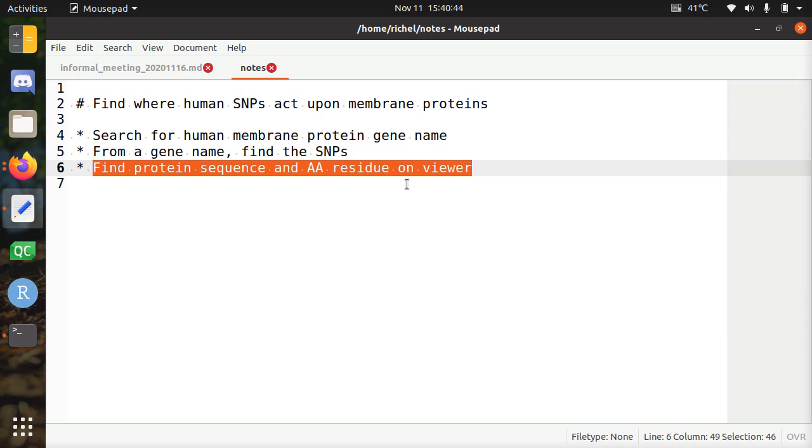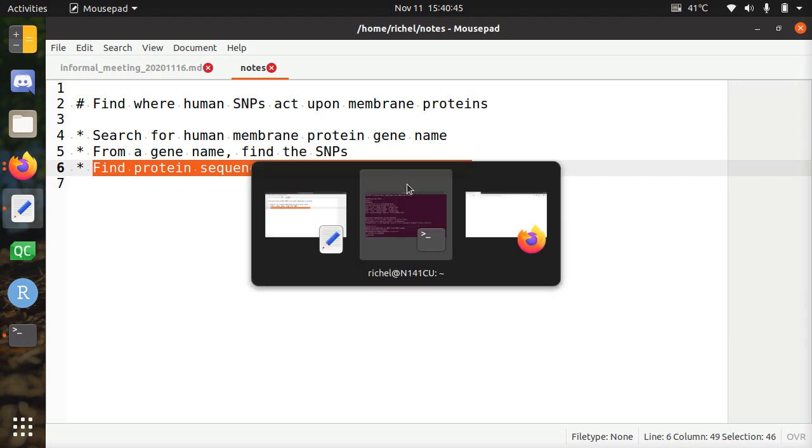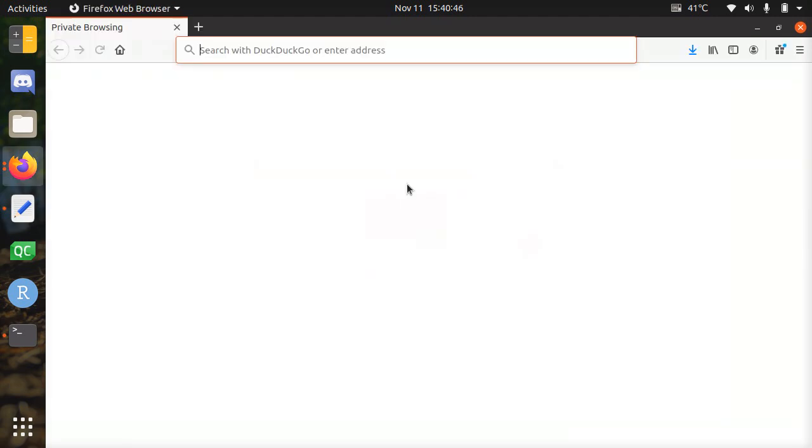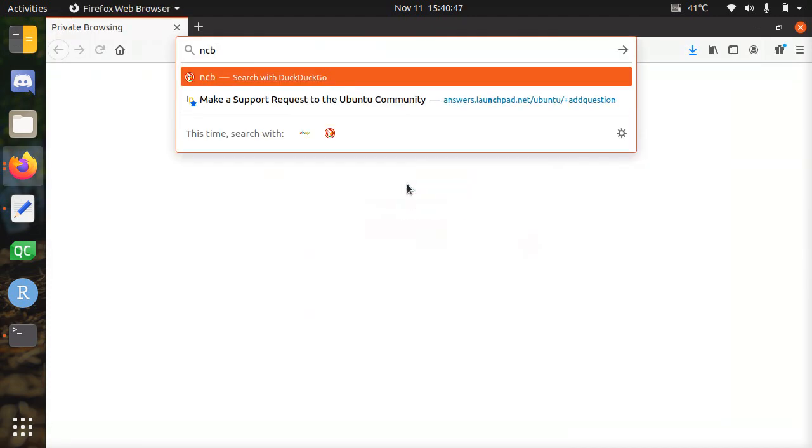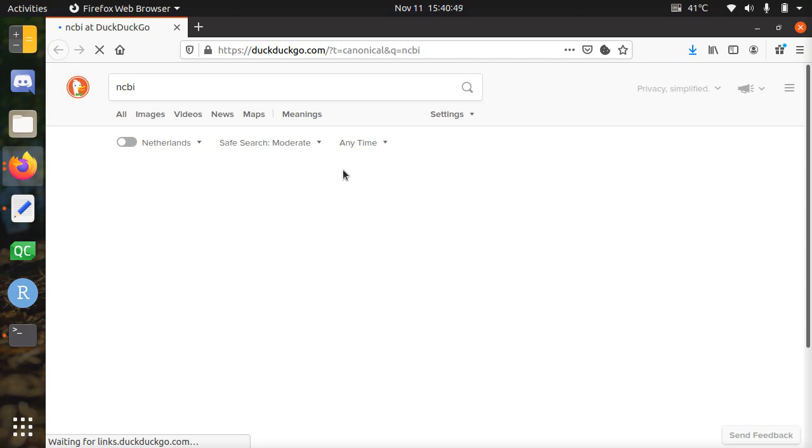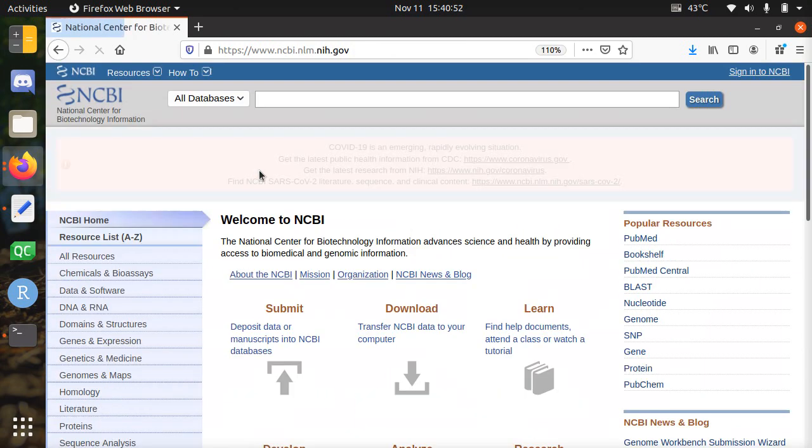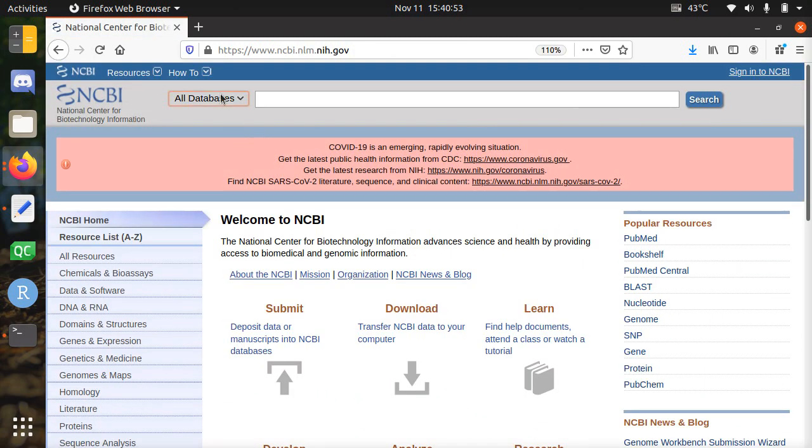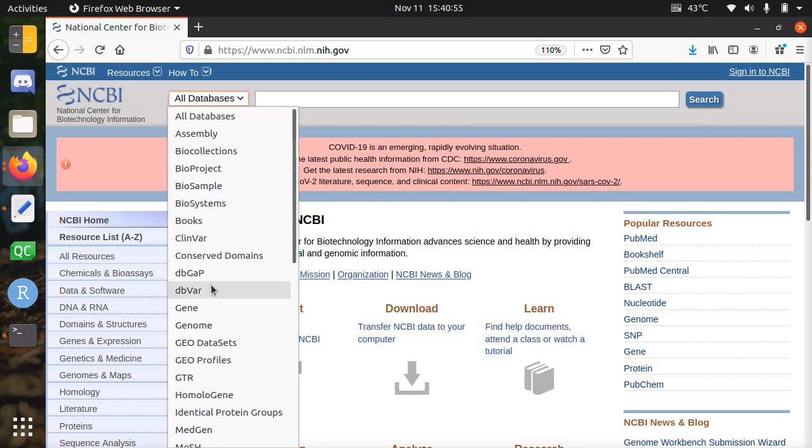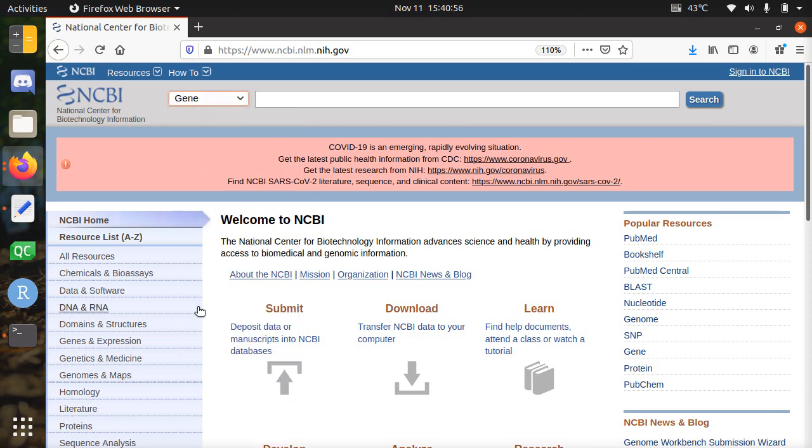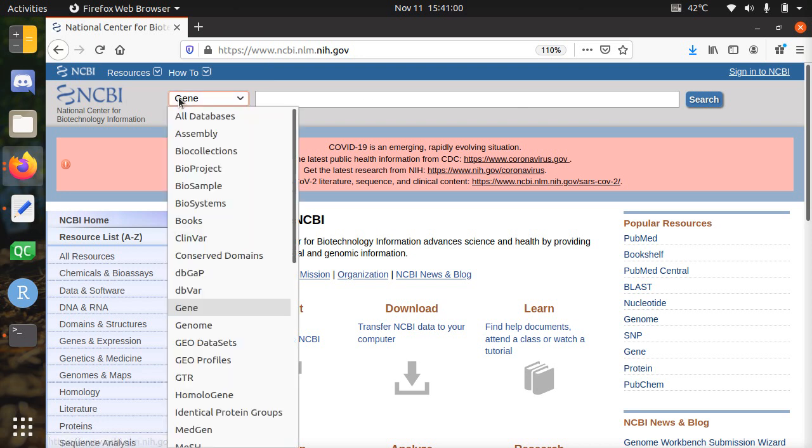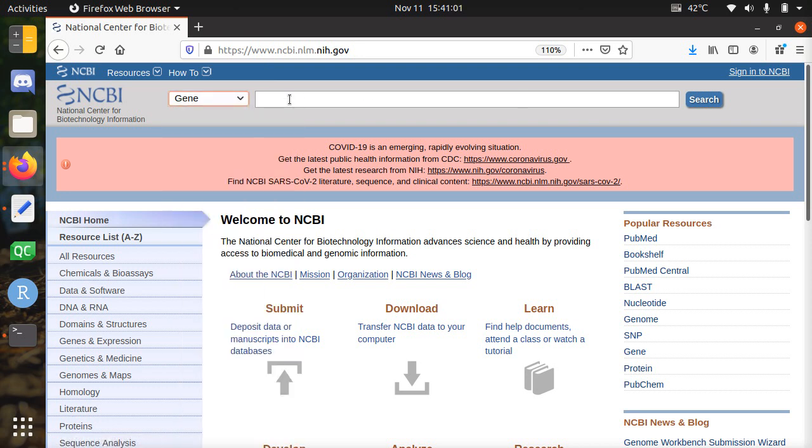Alright, I start with a clean slate. So first I go to the NCBI website. I just Google it and I go there. And we're going to look for, we need to have a gene name. So I click on the gene database.